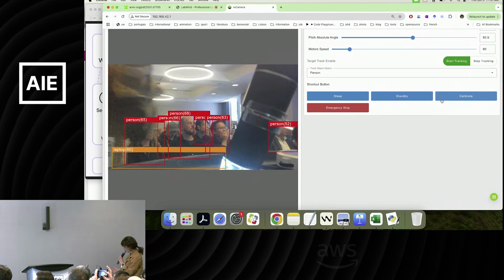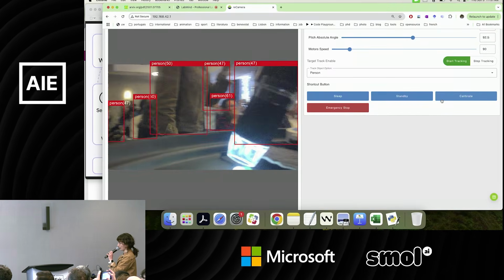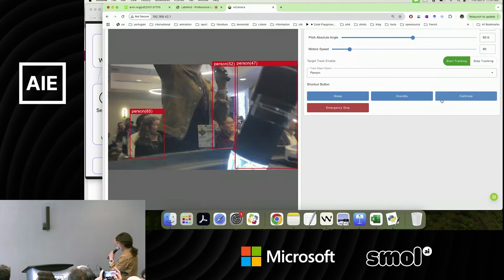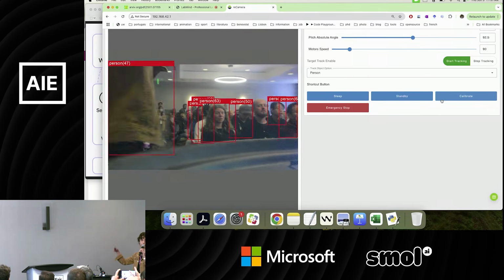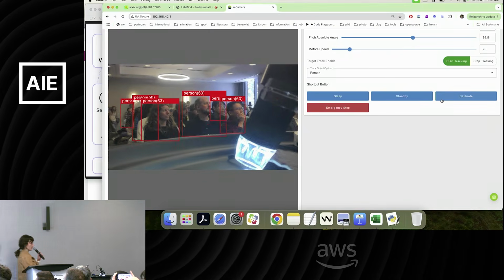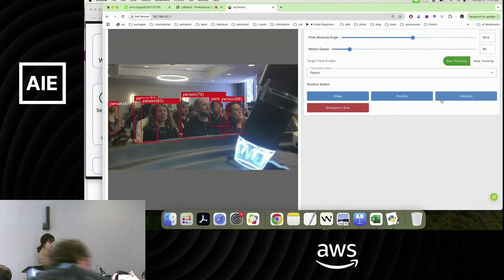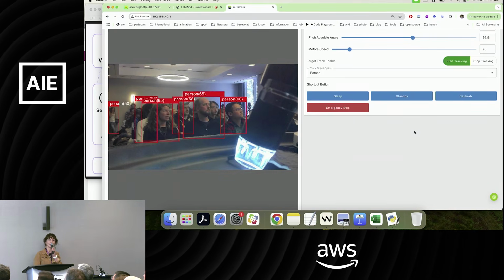But you could train a custom model to track crystal growth or specific objects that you want to monitor in real time. And this runs on Wi-Fi, so you can place it anywhere, and then control the conditions in the experiments, like increase the temperature or decrease the temperature. So, oh, it sees all of you. That's awesome.